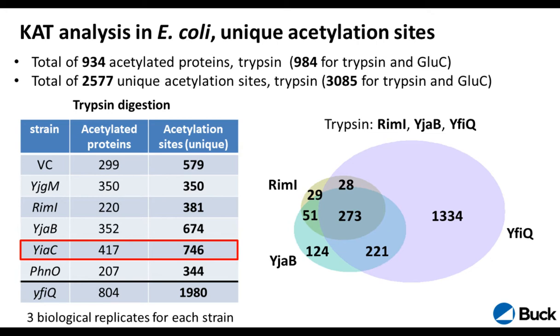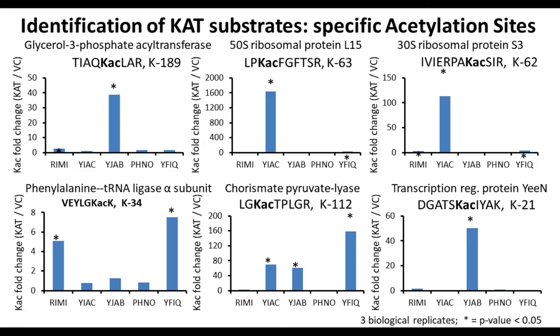That also is demonstrated in the next slide, where you can see some of the acetyltransferases would have specific targets for some of the acetylation sites in the given proteins here. Other acetylation sites would be more global and could be regulated by several of these acyltransferases.